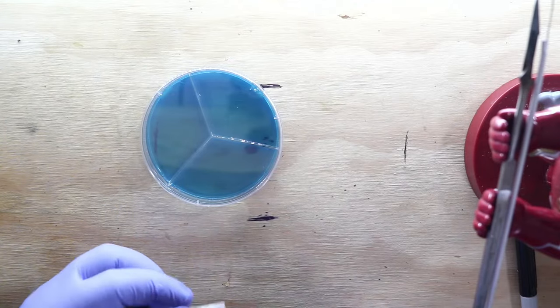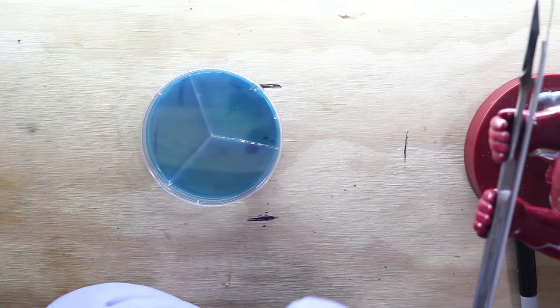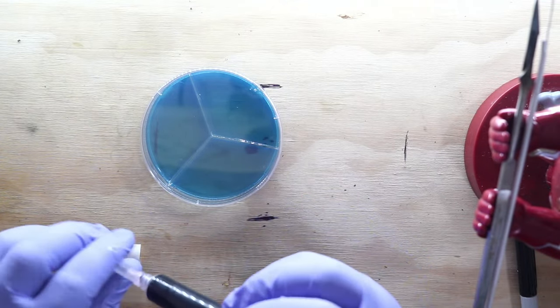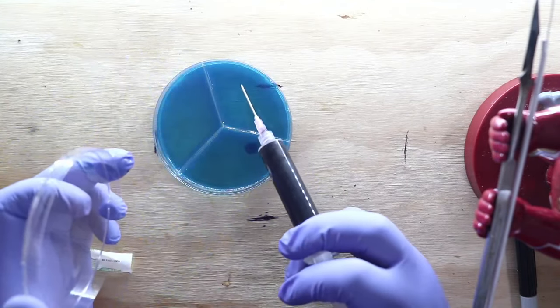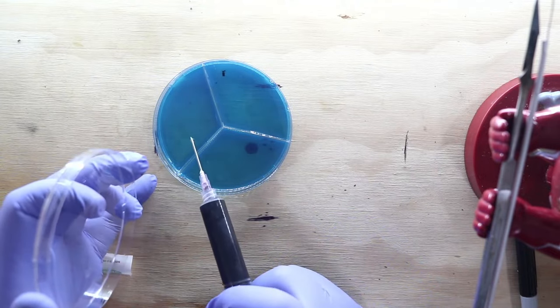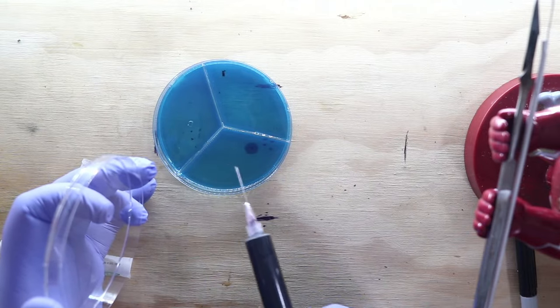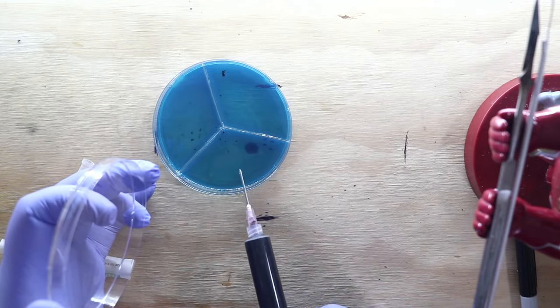I grabbed the wrong syringe for this. There we go. Alright, let me try that again. So Marie's right. Asked... Oh, go ahead. So you just do a little squirt. A few little drops. You really don't need much more than a few drops.